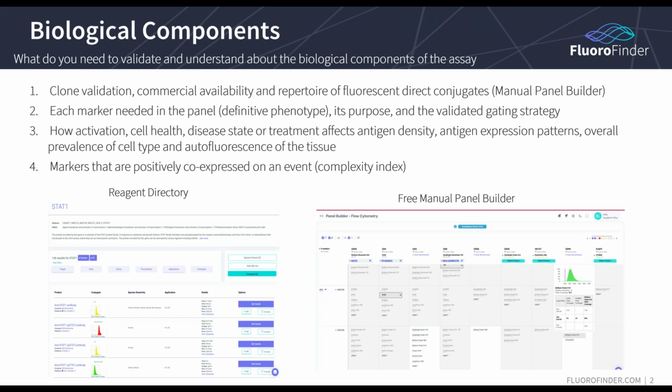It is how much each of those fluorophores spill into each other that gives you an idea of what the spillover spreading error might be, which might preclude you from being able to cleanly gate on that population. I know that's a little complicated, but it gives you an idea of not just a single spectral spillover between two channels, but the total spillover between all fluorophores that are on antibodies against antigens expressed on that cell.